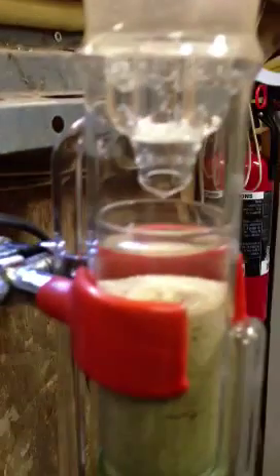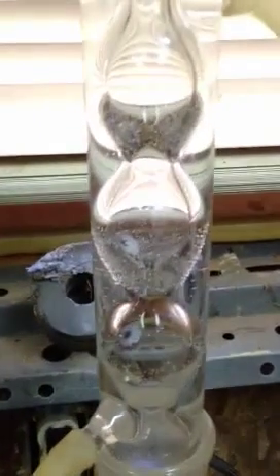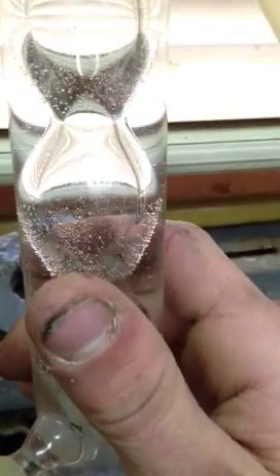The methanol comes up the flask, goes around this tube to the left here, and up to the top of the Soxhlet Extractor, where the vapor can travel up the inside of that tube with the condenser. The condenser is filled with cold water that is being pumped by this mechanism over here, with some ice and water bath.